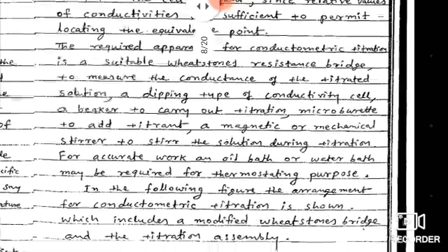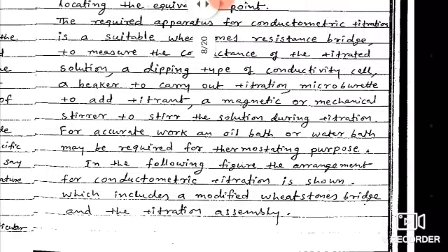For accurate work, an oil bath or water bath may be required for thermostating purposes. The following figure gives the arrangement for the conductometric titration, which includes the modified Wheatstone bridge as well as the titration assembly.